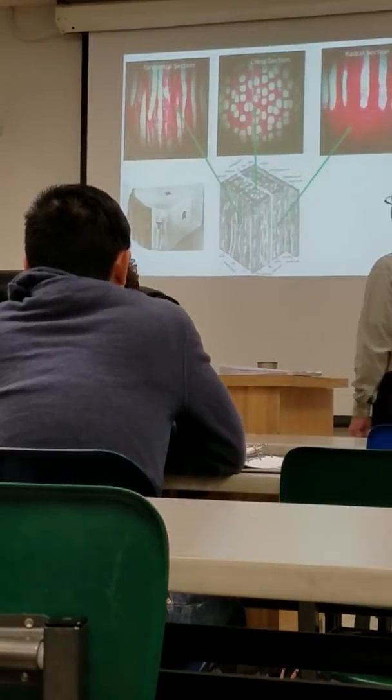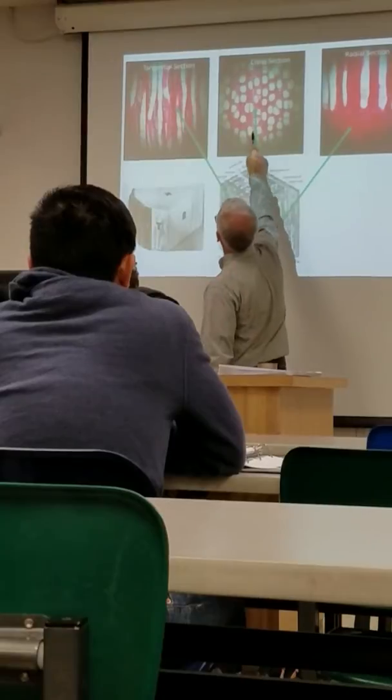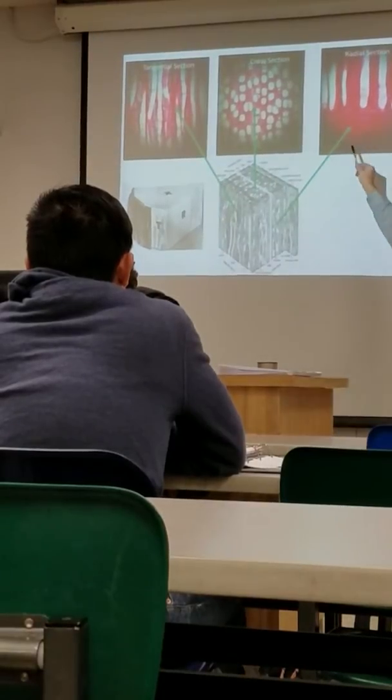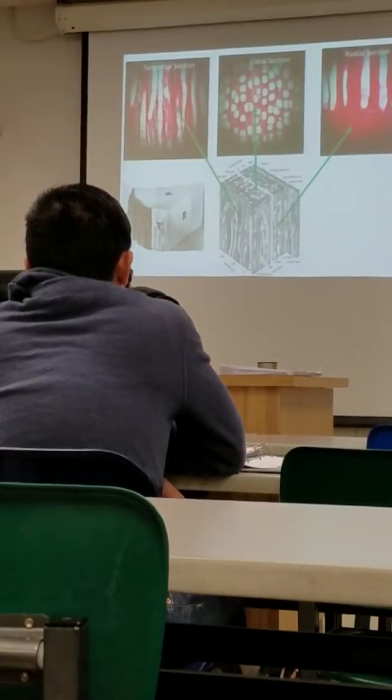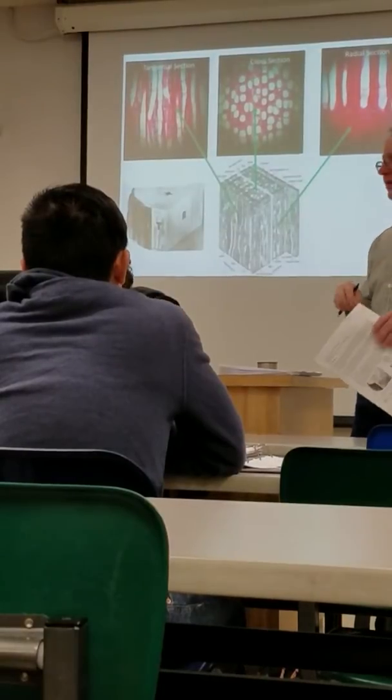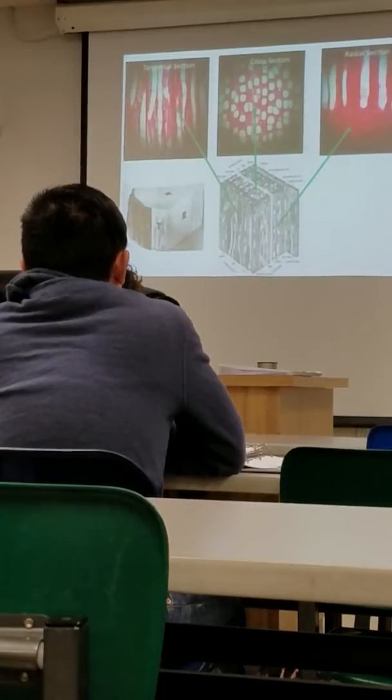So for instance, you label ray cells. These are ray cells, these are ray cells, these are ray cells. So again, I'm trying to get you to think about this 3-dimensional. So you have to look at 3 different sections on that microscope. So I put those on 2 microscopes because it takes a little bit longer to do that. Okay?